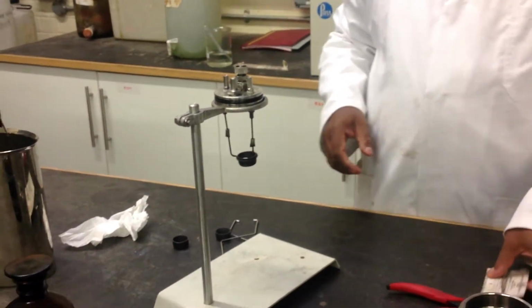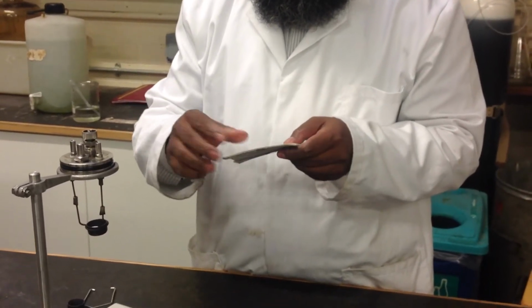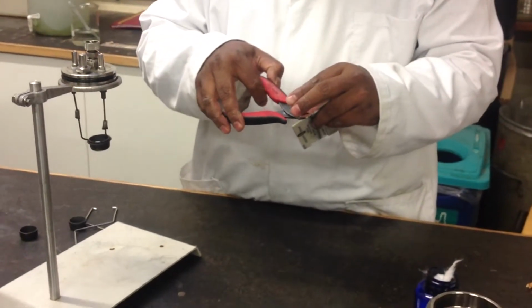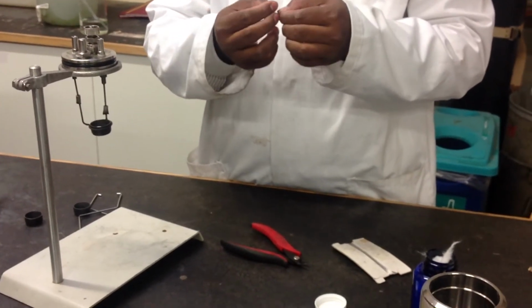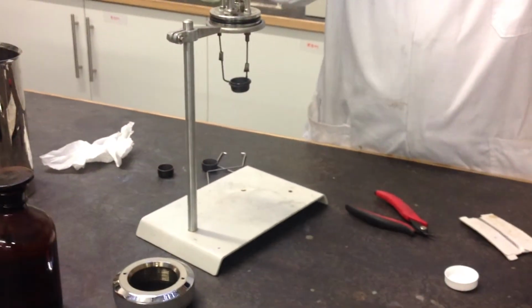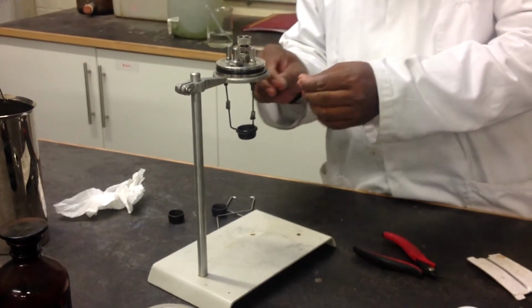And then take one card length of fuse wire from here using the plier provided. And then connect this fuse wire in between the electrodes.